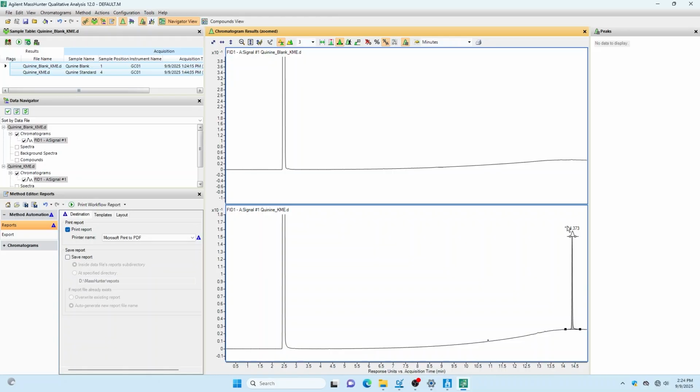And when I get a zoom that I like with my sample, I need to make the scale on the blank the same. I have to make the scale on the blank and the scale for the sample roughly the same. I have to compare apples to apples. I can't show a blank that's zoomed all the way out and then zoom way in on my sample and go, look, there was nothing in the blank. It was completely clean. But it's zoomed way out, so you can't actually tell anything at all.